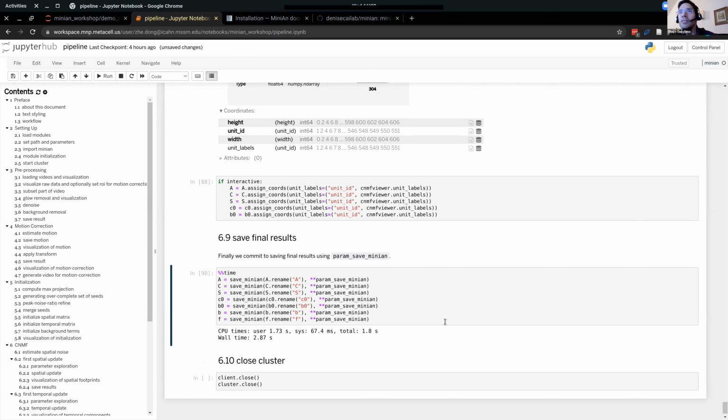Phil? Yes. Now that we went through it, do you guys have a batch version in the works or that you're already using? I made my own batch version, basically copy pasting from the notebook and adapting some of the outputs. But I was wondering if there's anything more optimized for that, or is this kind of the status now? This is kind of the status.